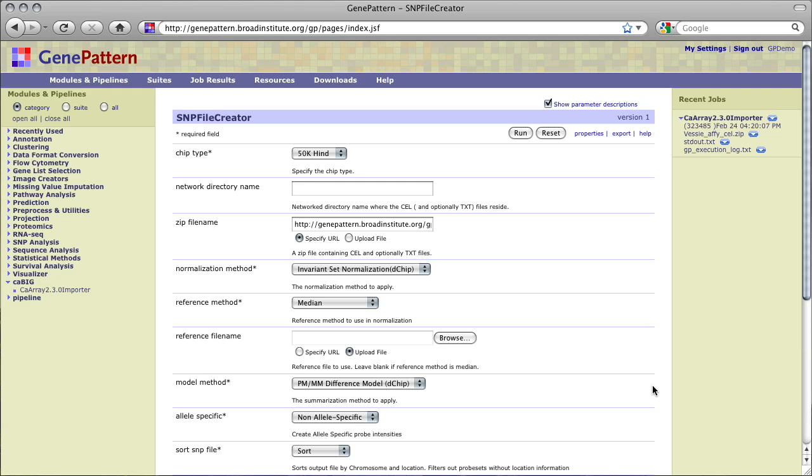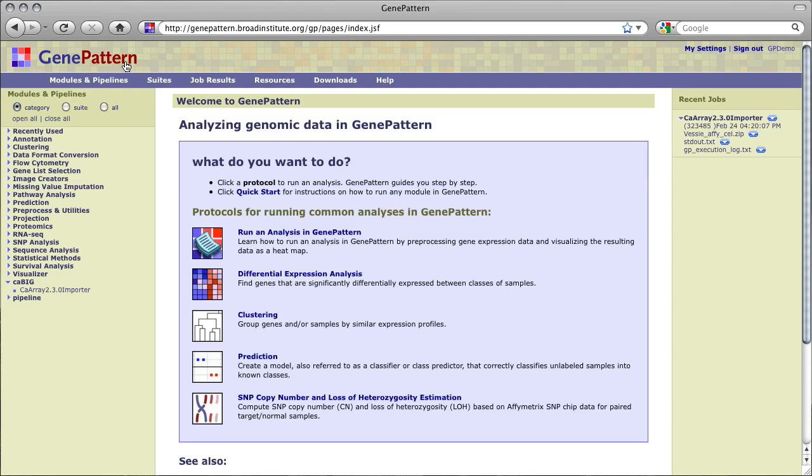In summary, the CA Array 2.3.0 importer module provides a quick method for importing CA Array experiment data sets into GenePattern, where there are tools to convert the raw or derived data into common GenePattern input formats, where they can then be passed to the many methods available in GenePattern for data analysis and visualization.